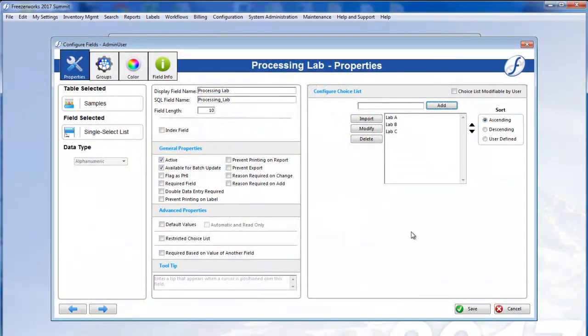Hi there. Did you know you can create fields that will default to predetermined data for all instances, or based on another field's value in the inventory record? We call these default values, and you can configure them for most field types.